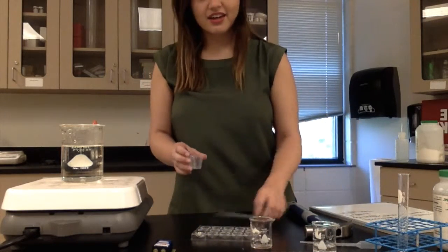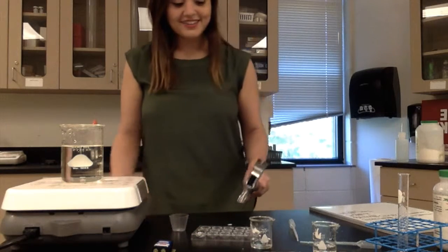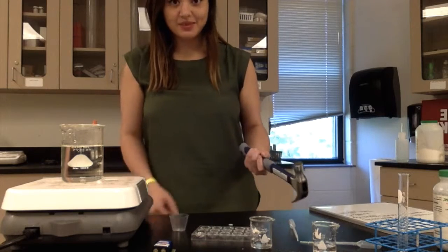After that, you take a last little bit of your sample and use a hammer to determine whether or not the substance is brittle.